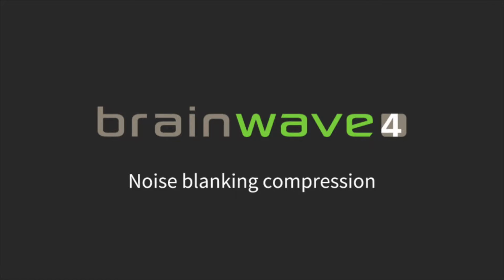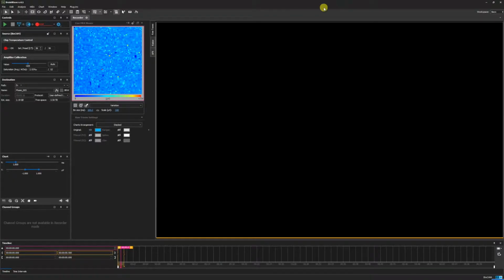Noise blanking compression. Recorded raw data in Brainwave 4 typically takes up about 8 GB per minute. To save up space on your hard drive, there are two compression modes available. In this video, we will cover the noise blanking algorithm.